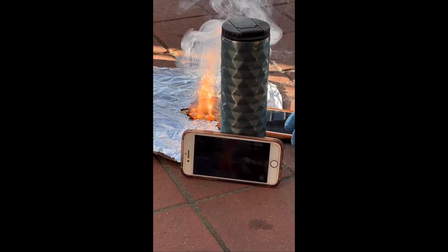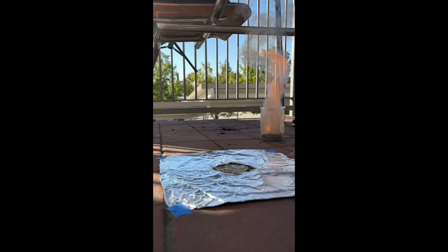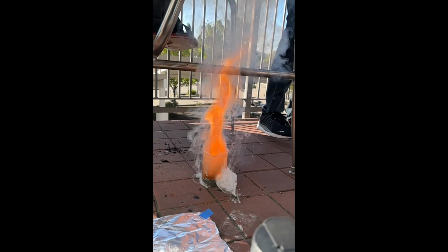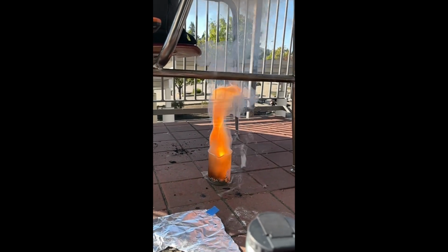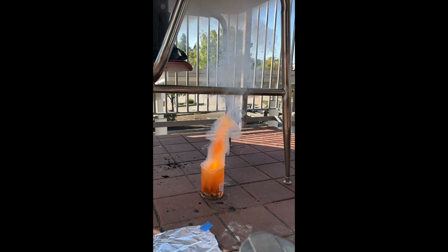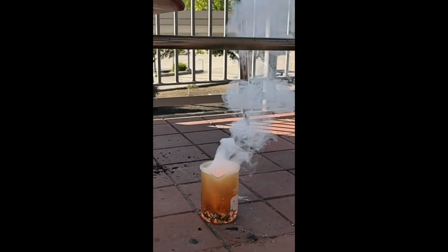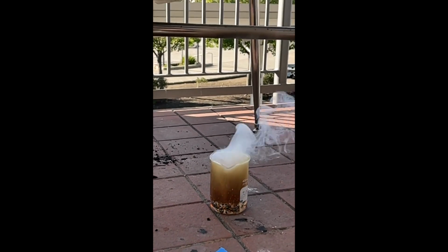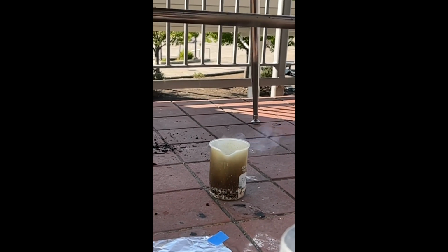Oh no! It lit the watch out. Yeah, I guess that's... Wait, the back. Be careful actually, it's going to crack the glass. So just be careful in case it cracks. But that's a good reason to move flammable substances, such as gunpowder, away from burning things.